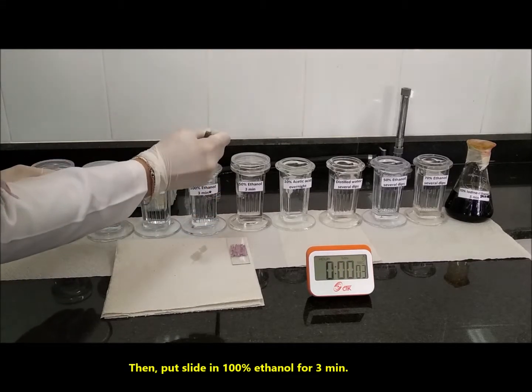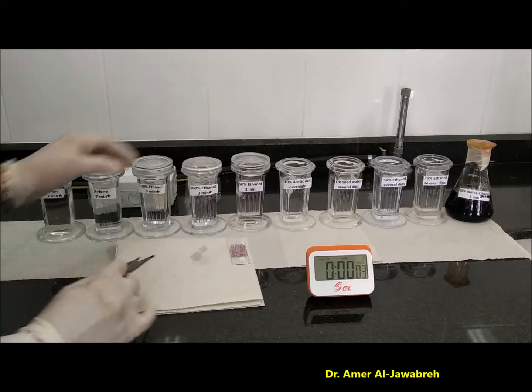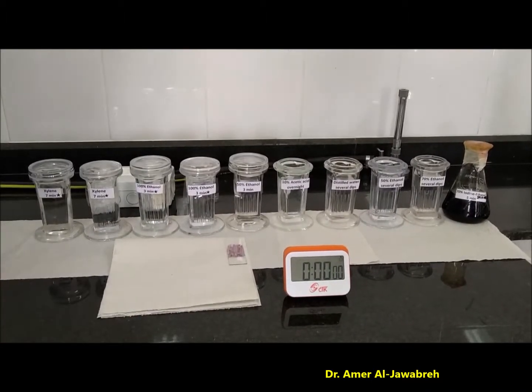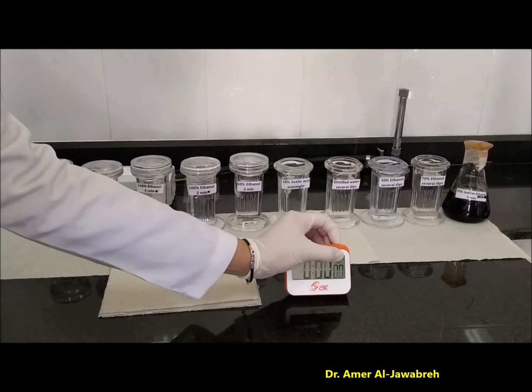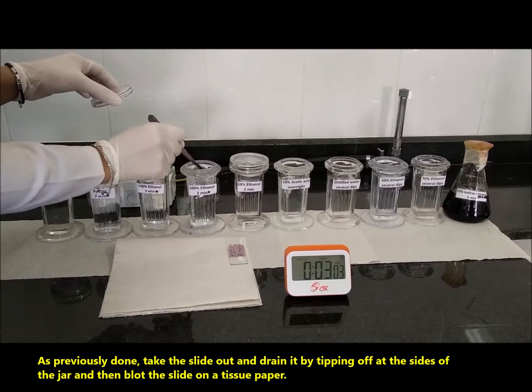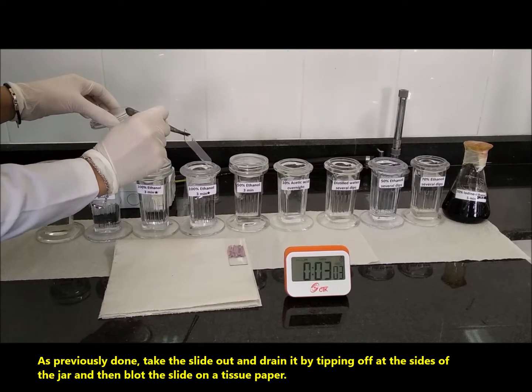Again, put the slide in 100% ethanol for 3 minutes. As previously done, take the slide out and drain it by tipping off at the sides of the jar, and then blot the slide on a tissue paper.